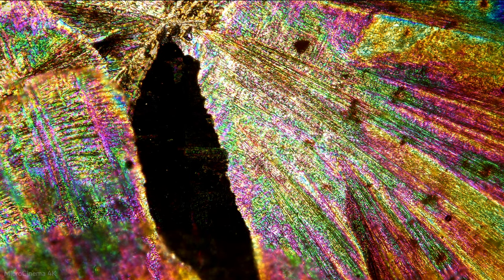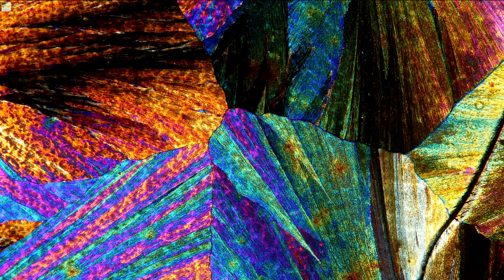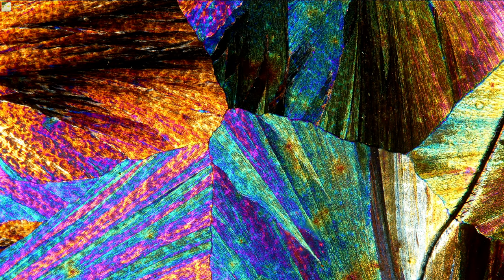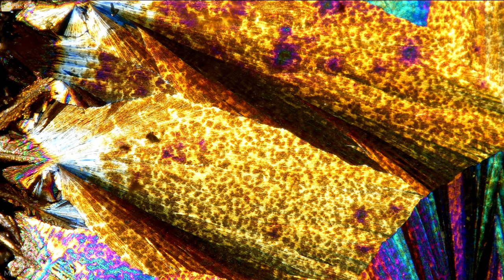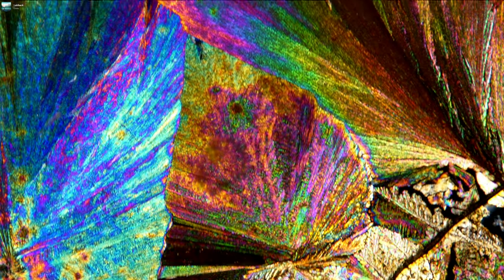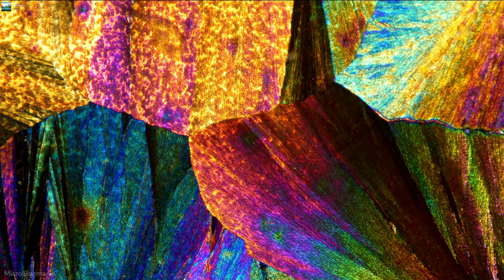Right now, Marcos, this is literally just cross polarizers. There's nothing else in there. Just regular old cross polarizers. So this is sort of illustrative of a distinction between certain materials. Some materials just have a light and dark polarization response. They don't have a wavelength dependence. And to make the things that are just light and dark turn colorful, that's when we use the wave plate.